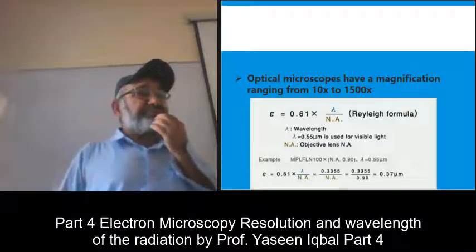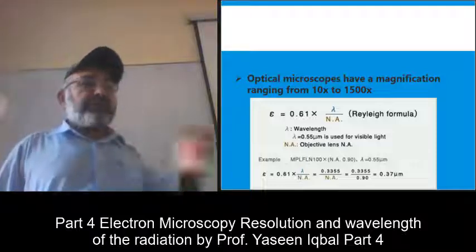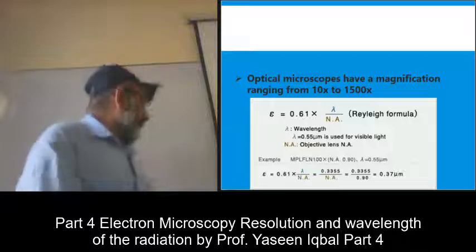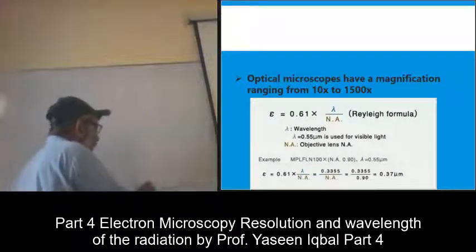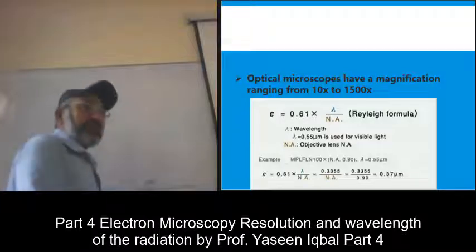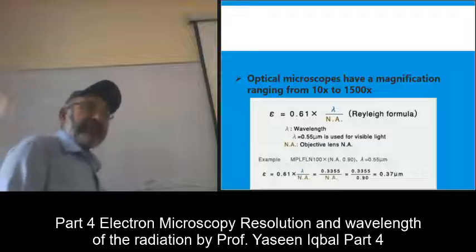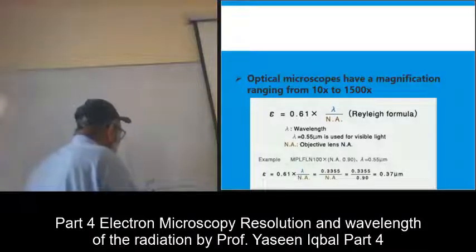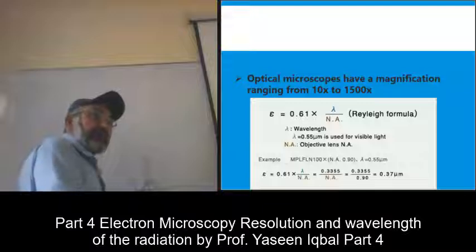In X-ray, you commonly see that if you have an XRD pattern of a material, and the interplanar spacing is 3.37, then it should be a single line there at 3.37. But what you get is a peak like this.